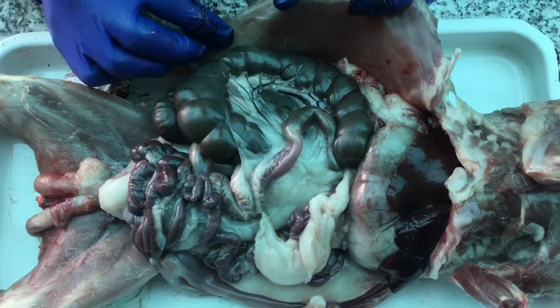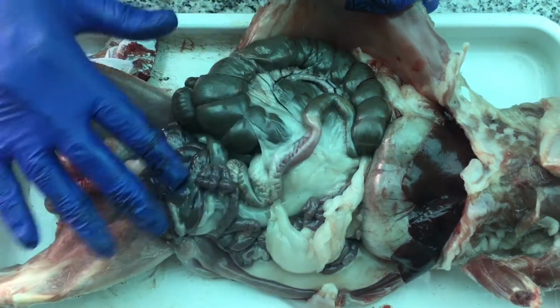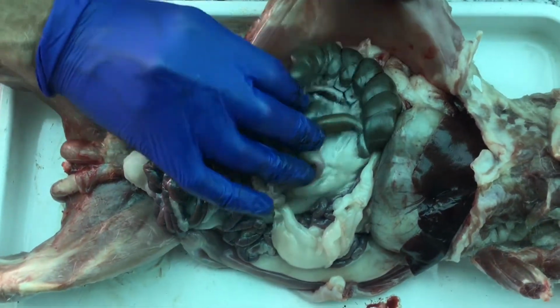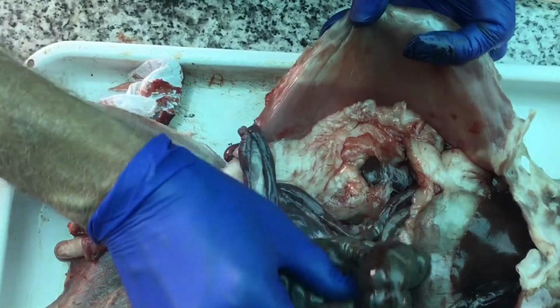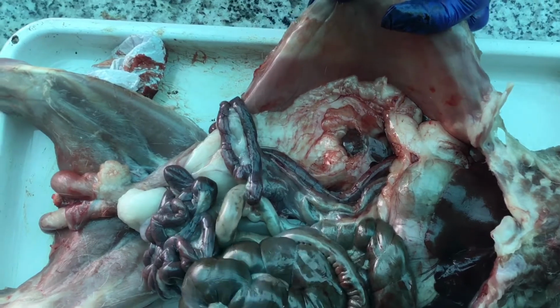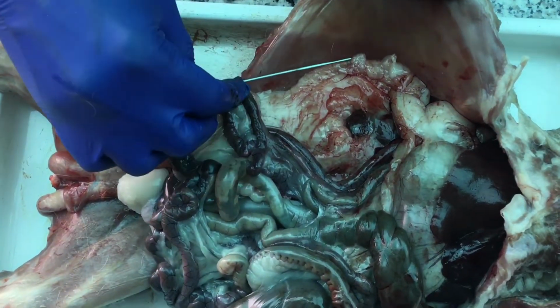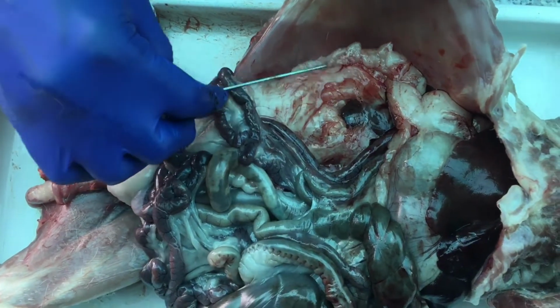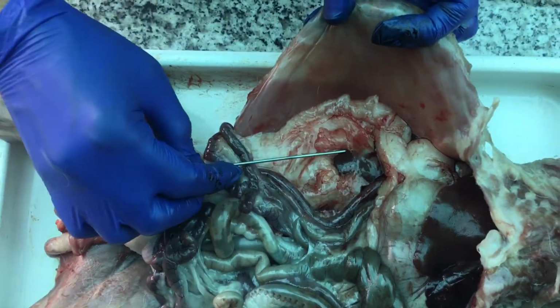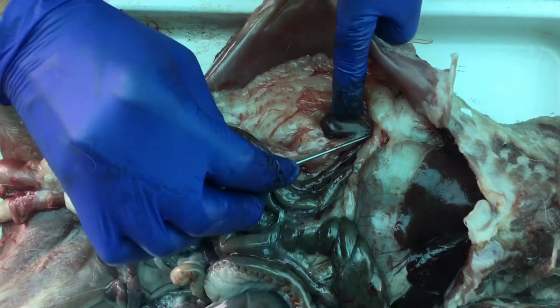So one last thing to see in the abdominal cavity, here's all of the intestines that, of course, we're not worried about the layout in a rabbit because it's so different. But if we move all the intestines aside, remember, here's my outer tube of the body, my muscular wall of the abdomen with parietal peritoneum. It's covering over some fat that's laid under the parietal peritoneum, and here's where I've cut through that fat, and I can see the kidney on the right side.